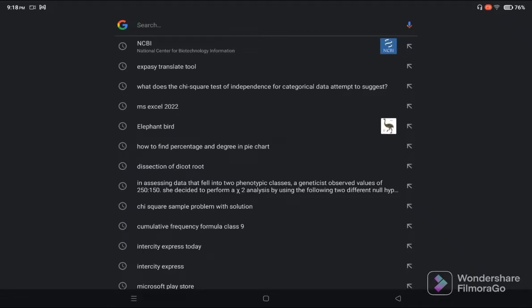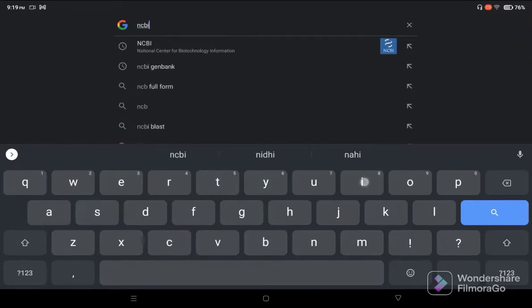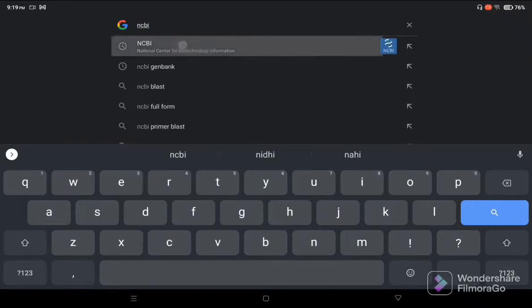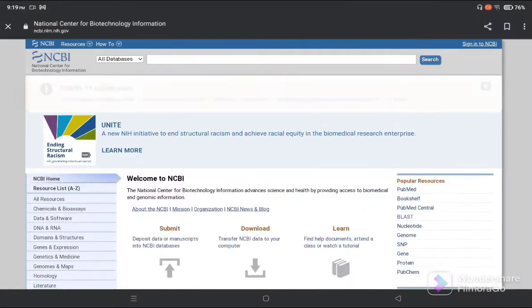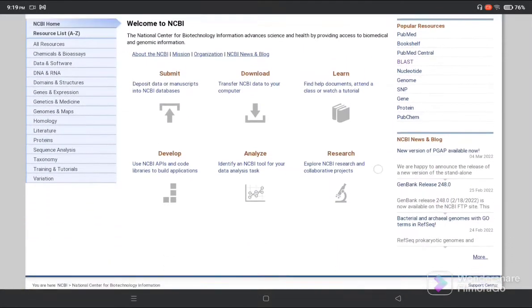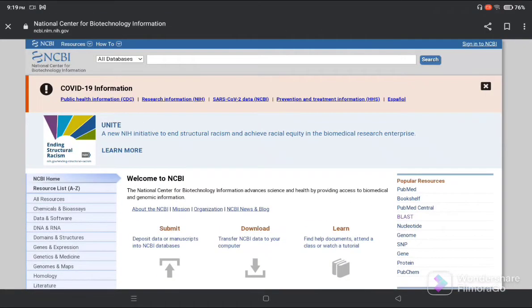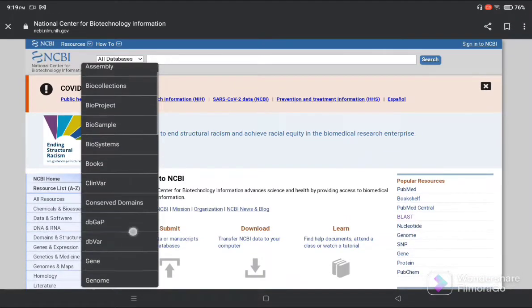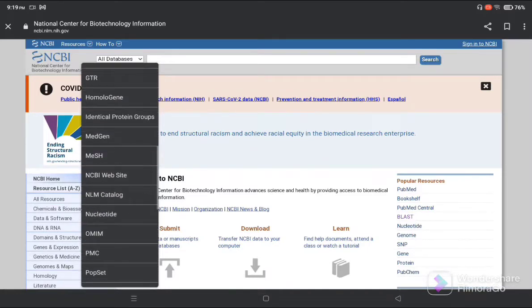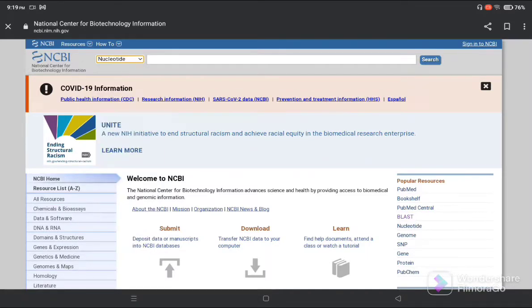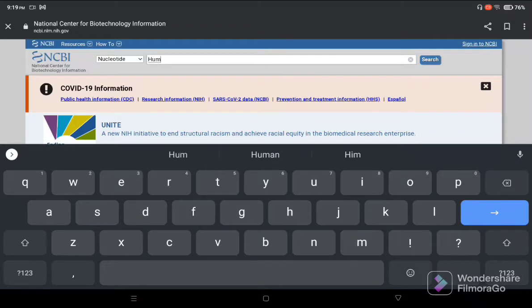Now the procedure: First of all, go to NCBI. Click on NCBI. After that, you can observe the NCBI home page will open. Then go to all databases on your left and click nucleotide. Today we will search for human hemoglobin and click the search button.